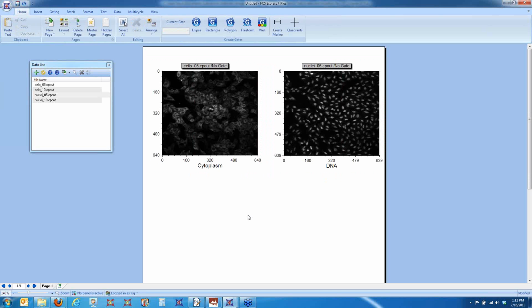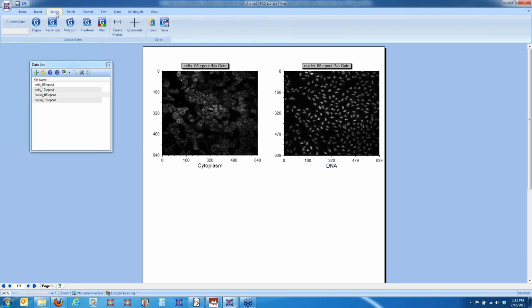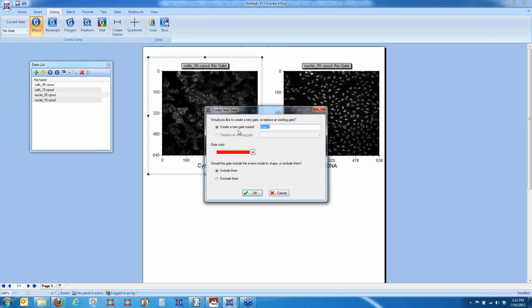So it's really easy to manipulate your objects in FCS Express. So what's the first thing you would do if you were dealing with flow cytometry data? You would probably start creating a gate on populations of interest, right? So let's do the same thing now with our picture plots. I'm going to make an ellipse gate and draw it on the central cluster of cells in my picture plot. And let's call this our picture plot gate.